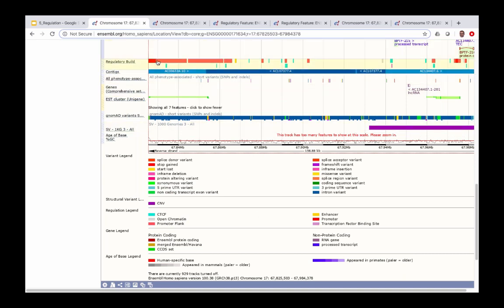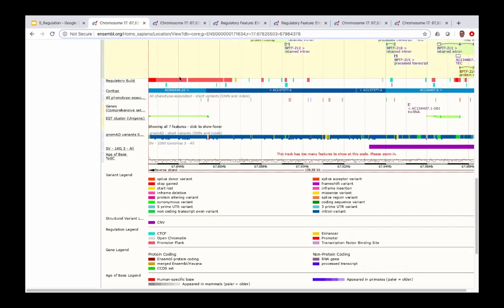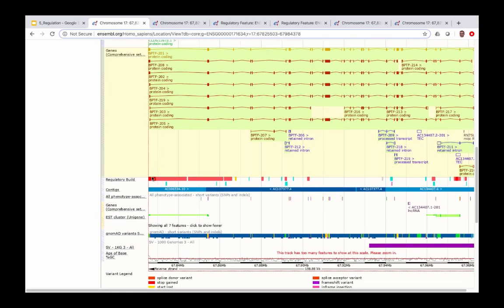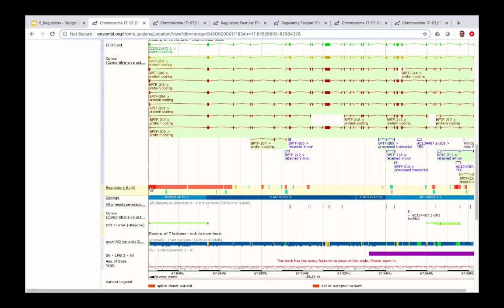In the regulation legend, each colored feature represents a type of regulatory feature: dark red is a promoter, salmon is a promoter flank, yellow is an enhancer, and turquoise represents CTCF binding features. Even though Ensembl does not directly associate regulatory features to genes, a promoter that exists at the very 5' end of our gene of interest — BPTF — would be a good starting point for investigating potential regulation of BPTF gene expression.